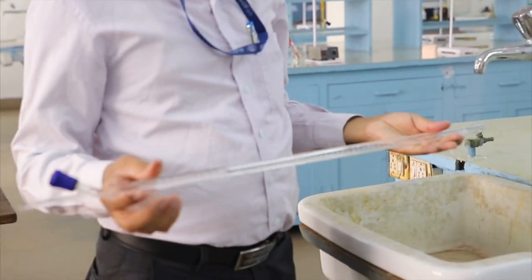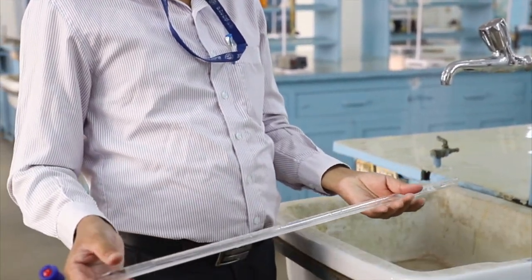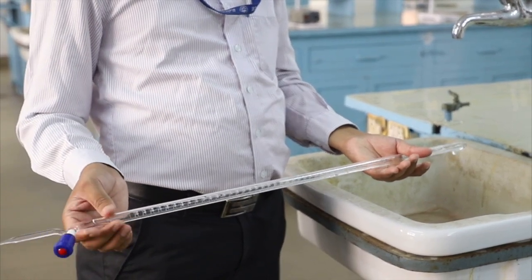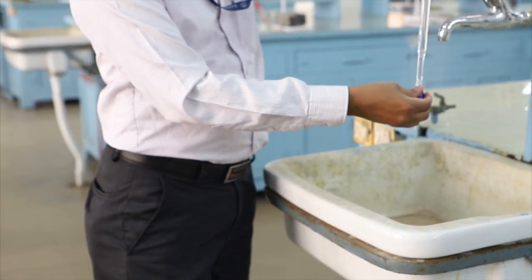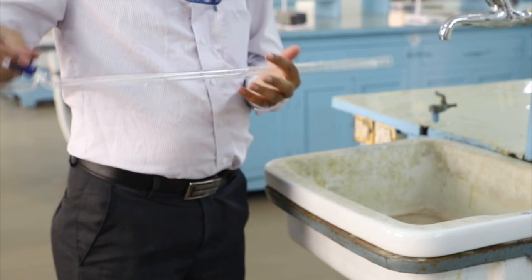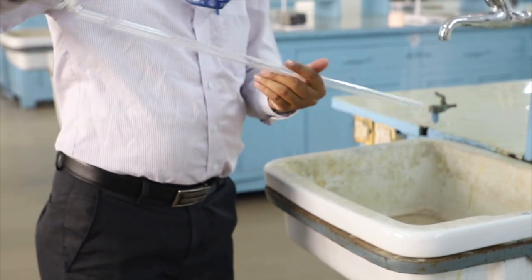You can avoid touching the chemical. You don't have to shake like this. You can hold it near the sink like this and make sure that all parts inside the buret are completely washed or rinsed. Then you can discard the distilled water present inside.